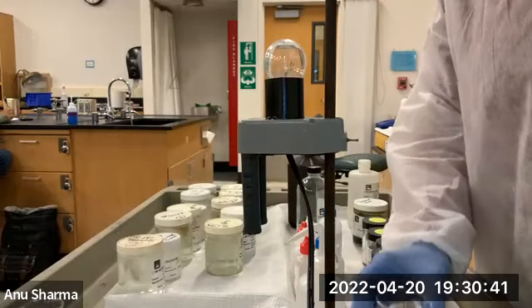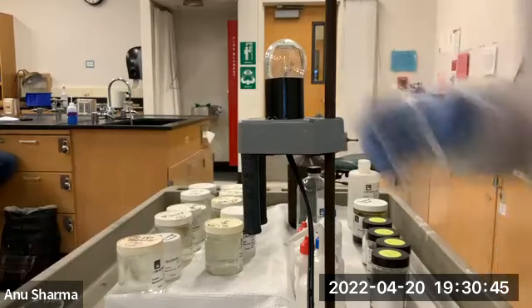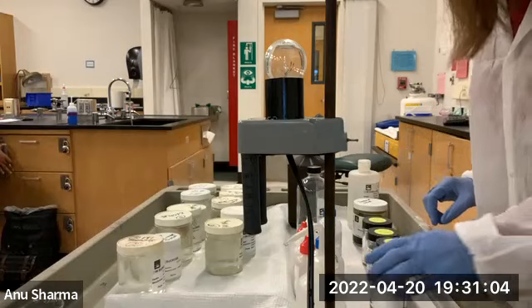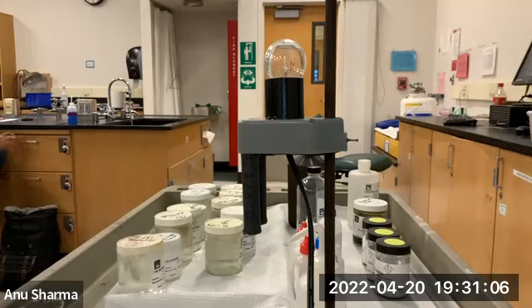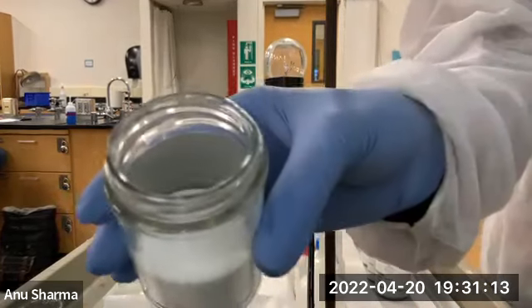All right, now we have, let me just put this here. Okay, the next is table 2, table B, test of the household samples. Here we are looking at the solubility in water, strong and weak electrolyte, major species and minor species. Now we are looking at the baking soda. We've all seen it, right?